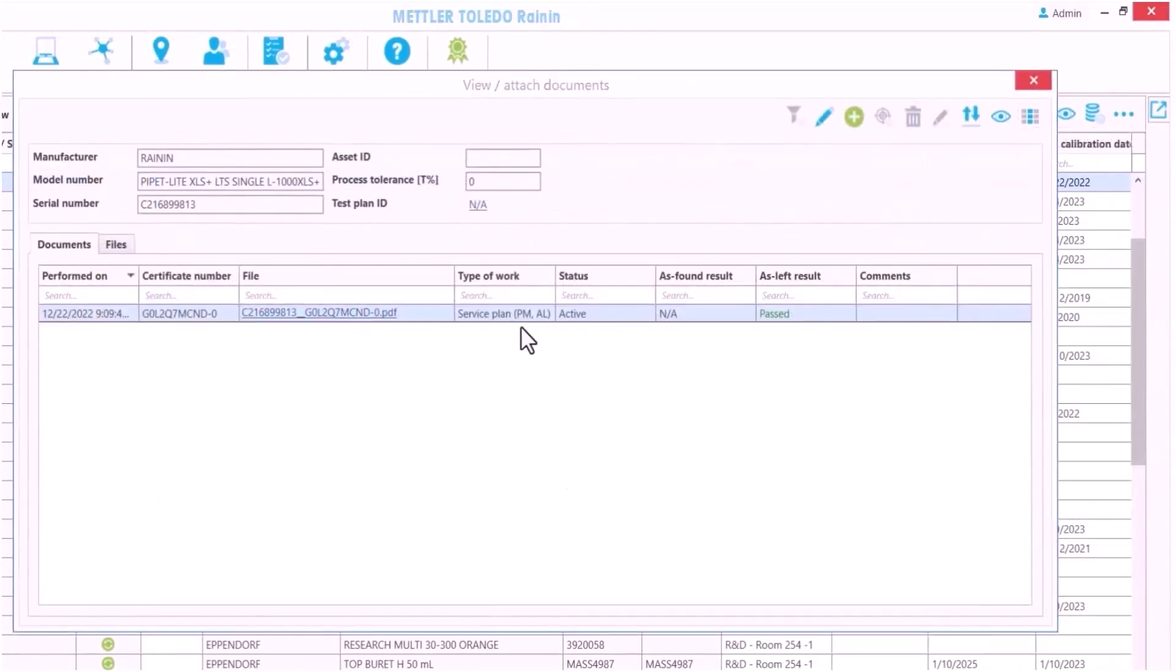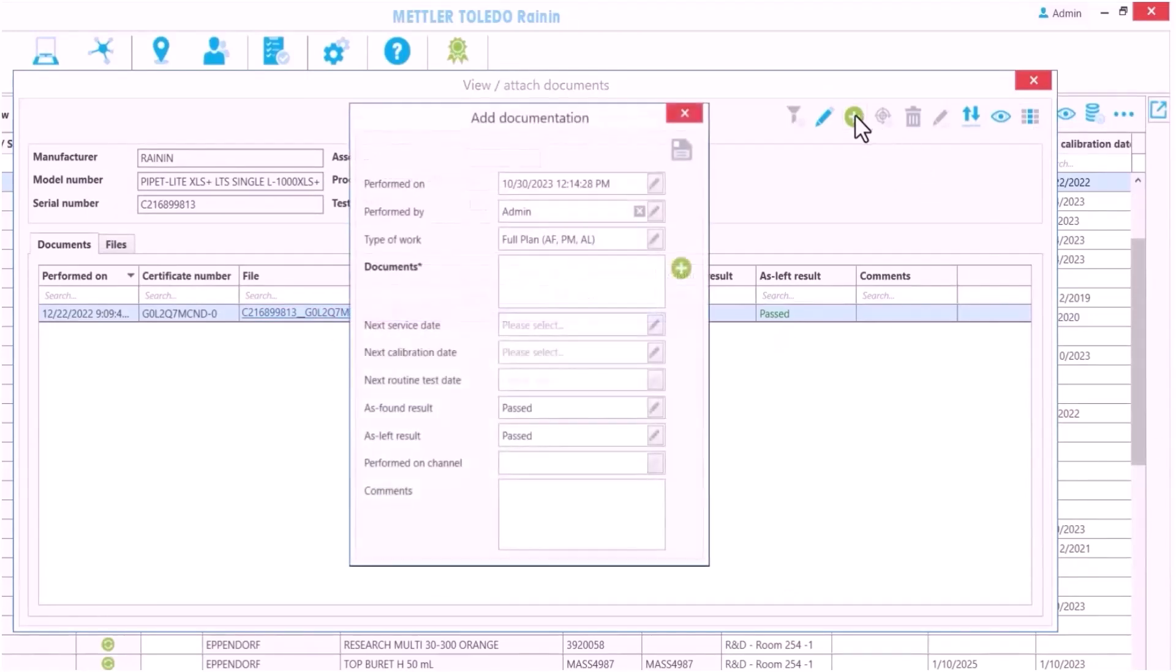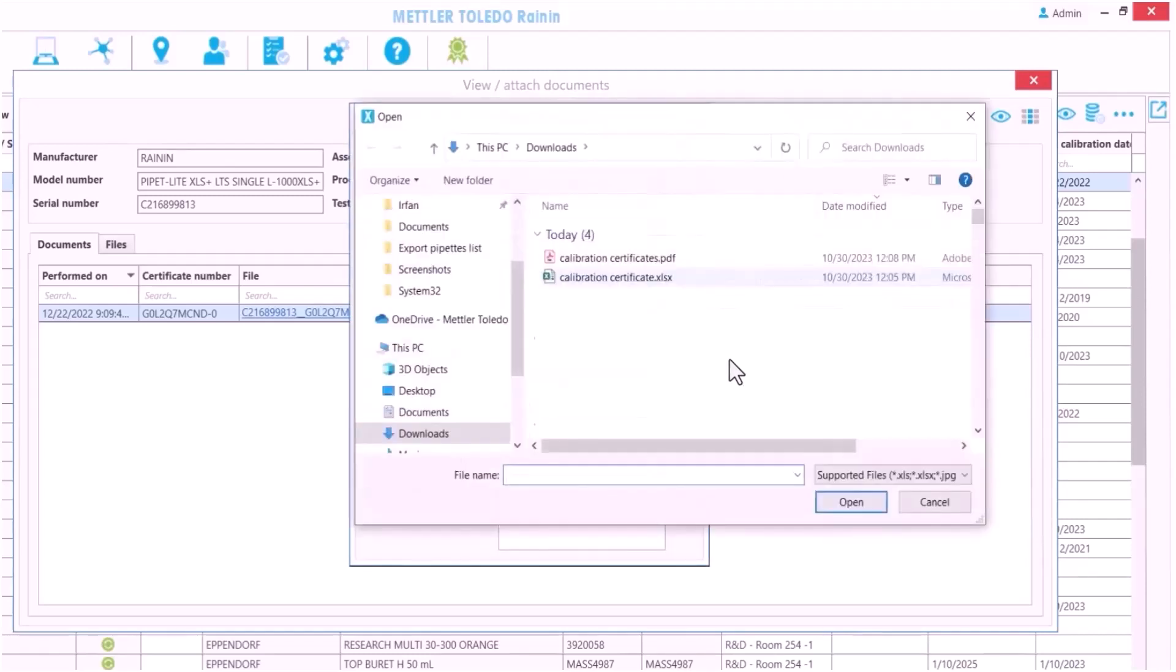Here is the certificate file and you can see the past status of pipettes. To fill out a pipette's history, I can also manually add older certificates.